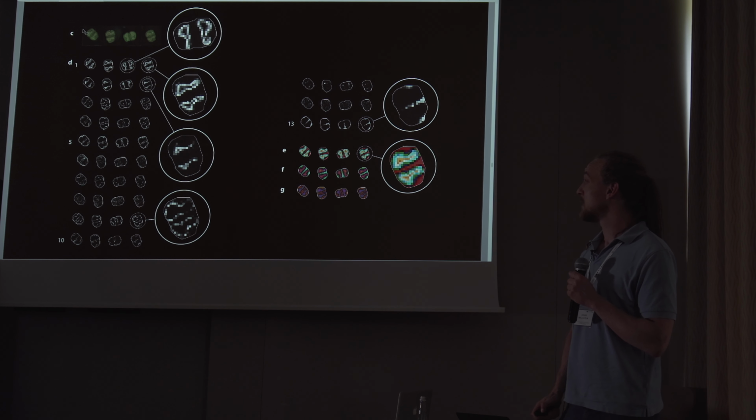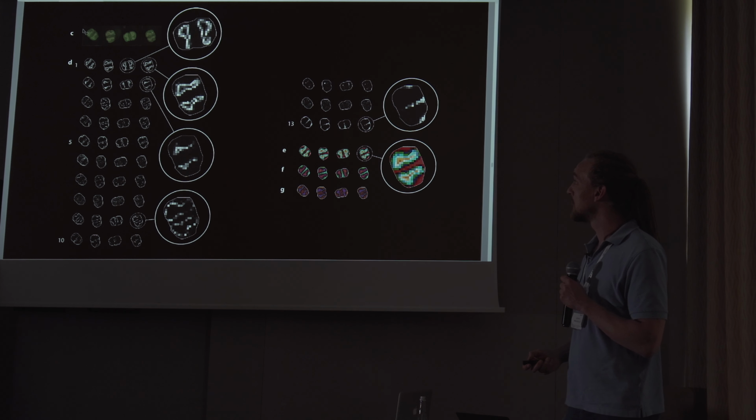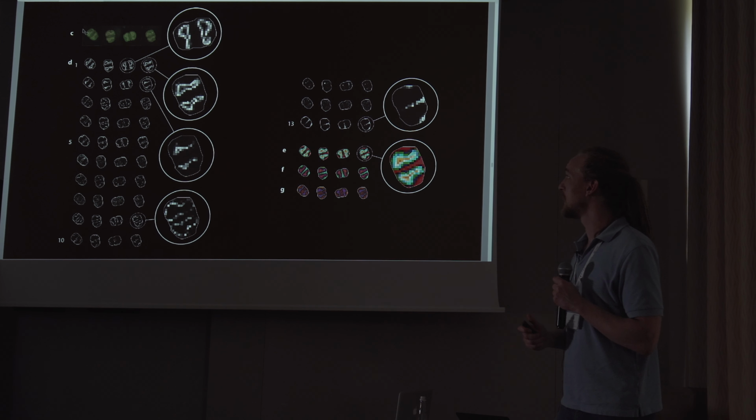The point that I want to make about these results is that we observe a high degree of consistency. For example, here is enlarged the same pattern in 2 samples. And you will notice that, although they're rotated, they are really very similar.